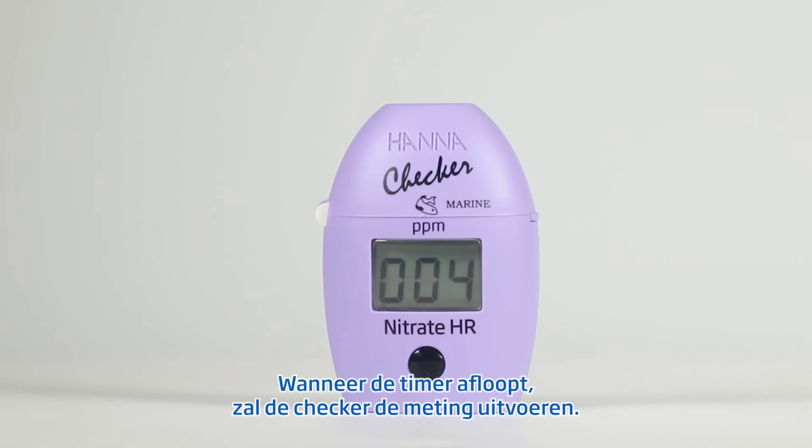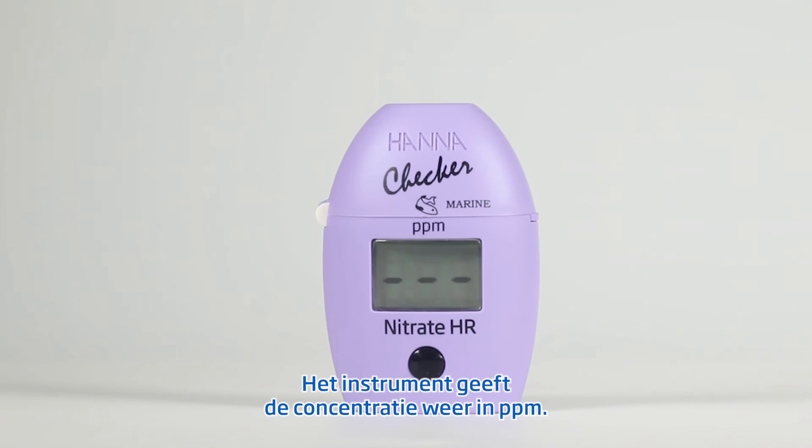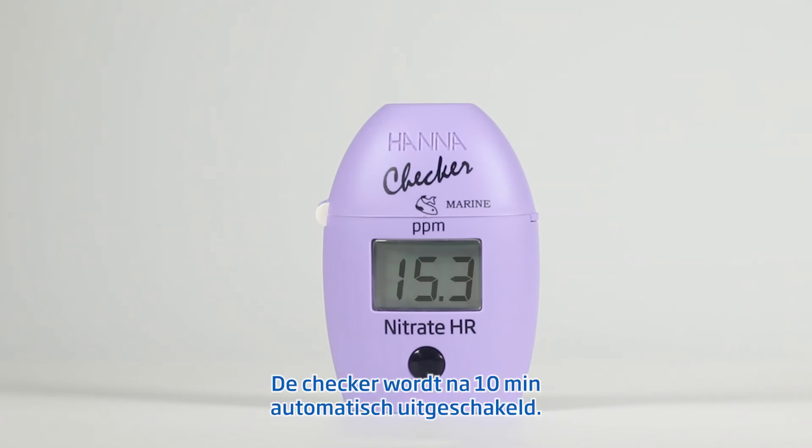When the timer ends, the checker will perform the reading. The instrument displays the nitrate concentration in PPM. The checker automatically turns off 10 minutes after the reading.